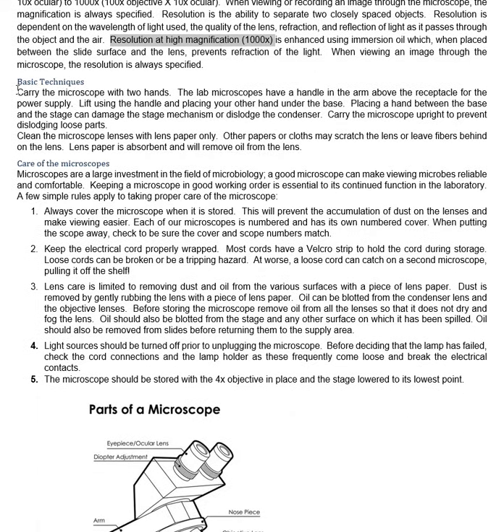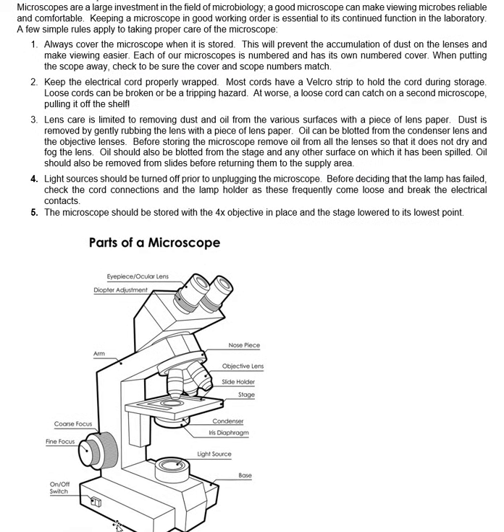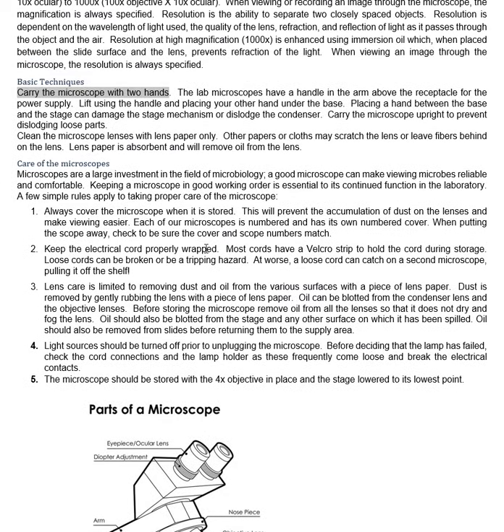Okay, I think we may have mentioned this. Maybe no, I'm sorry, it was A&P1. As far as carrying the microscopes, you always put one hand around this part right here, one hand under the base. That's how we carry these guys. Already talked about that. Always carry it upright.